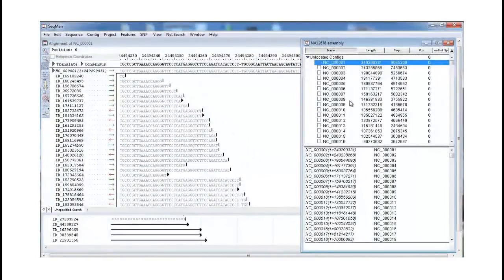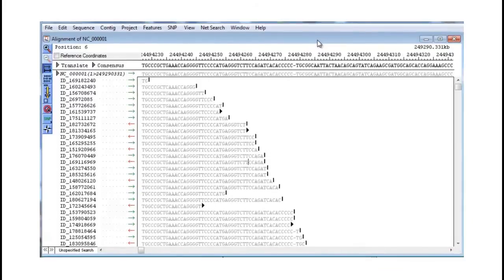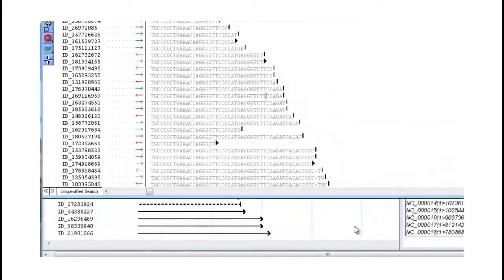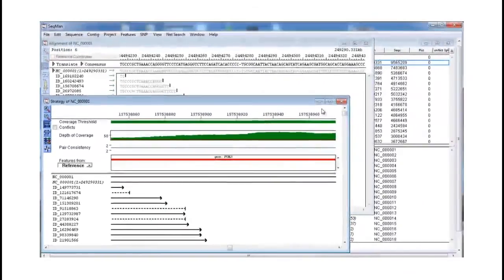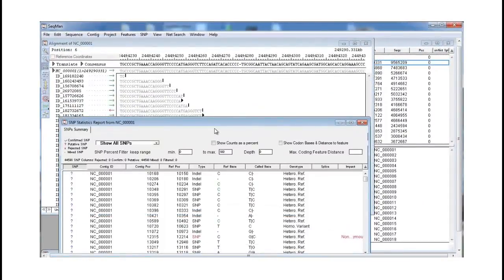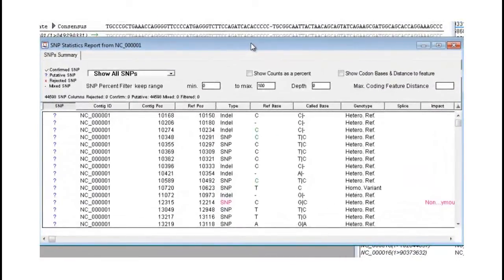Our SeekMan Pro application then allows you to examine the output files in the context of your assembly. There are many different views available, such as the alignment view to examine the details of your sequence alignment features and individual consensus conflicts, or the strategy view to see an overview of coverage, conflicts, paired-end data consistency, and consensus features. Additionally, you have the ability to analyze SNPs through live interactive SNP filters and reports.